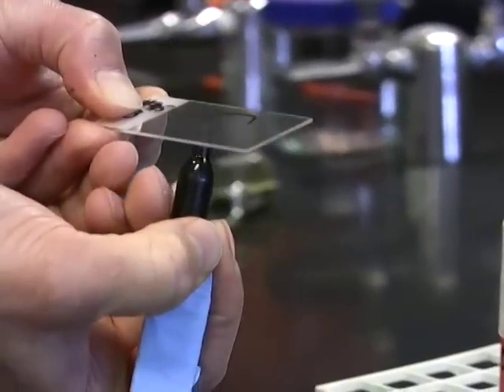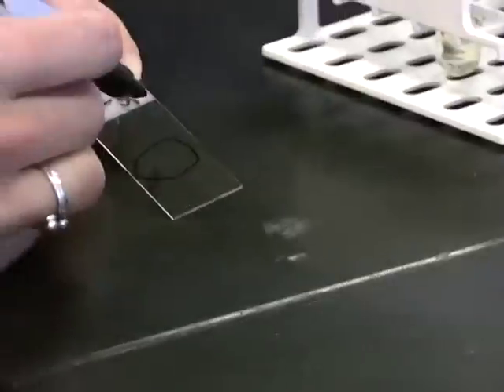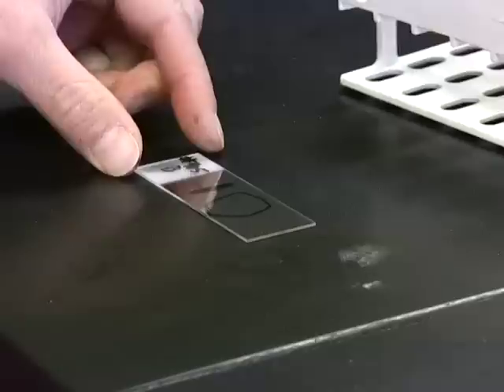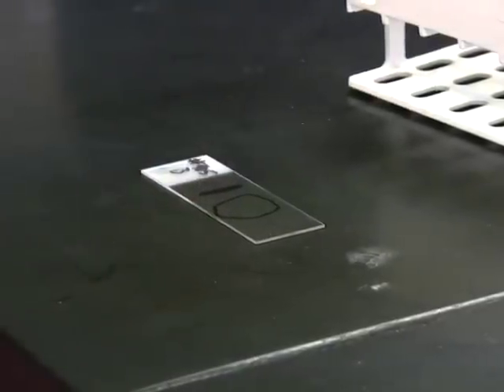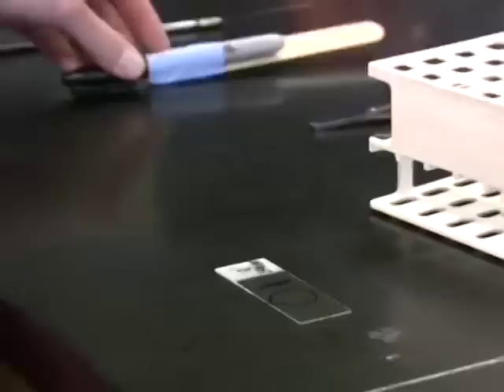Go ahead and draw a circle on the bottom of your slide — hopefully your circle will be better than mine. And put a focus line on the front of the slide. Remember, a focus line is not for wimps; it's for those who like to make sure that they get their lab work done quickly and efficiently.